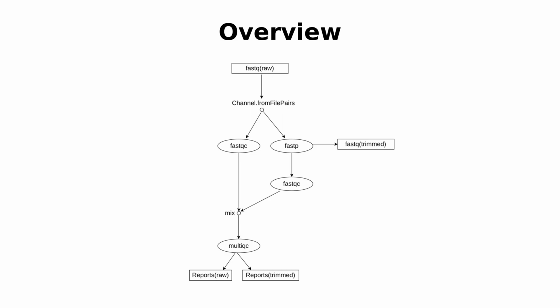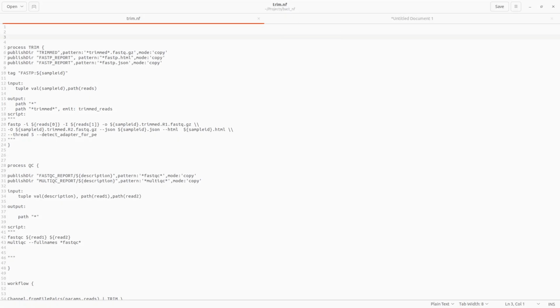I'm going to explain the different steps we are going to use in Nextflow so that beginners will also understand and use that knowledge to build their own pipelines. Let me also say that the script for the tutorial is available. For those who want the already made script, there's a link that you can use to download it. Basically, we are going to follow these commands.